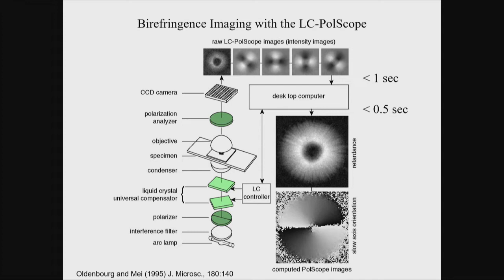You can change the polarization from one state into another uniformly across the whole field of view, and the whole thickness here is maybe 9 millimeters. So if it's bonded together, it's very innocuous also for imaging. It doesn't really affect the imaging quality, this thin plate.